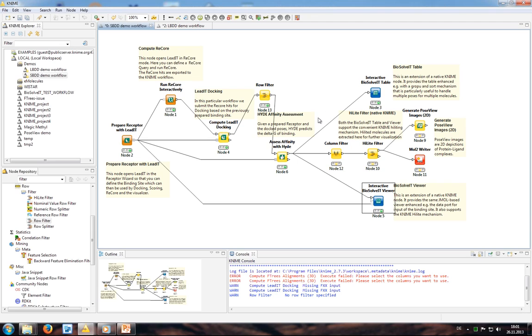The affinity calculation has completed. I can execute the table view. You see here we have a HYDE score. If I sort in ascending order we have very decent HYDE scores of minus 55 here. Here is your rudimentary 3D visualization. You can switch on the HYDE coloring, so you get the red and green colors. We do indeed here find a replacement pattern with a very nice HYDE score. With that I'm going to end the presentation. Feel free to ask any questions now, unmute yourself and go ahead.